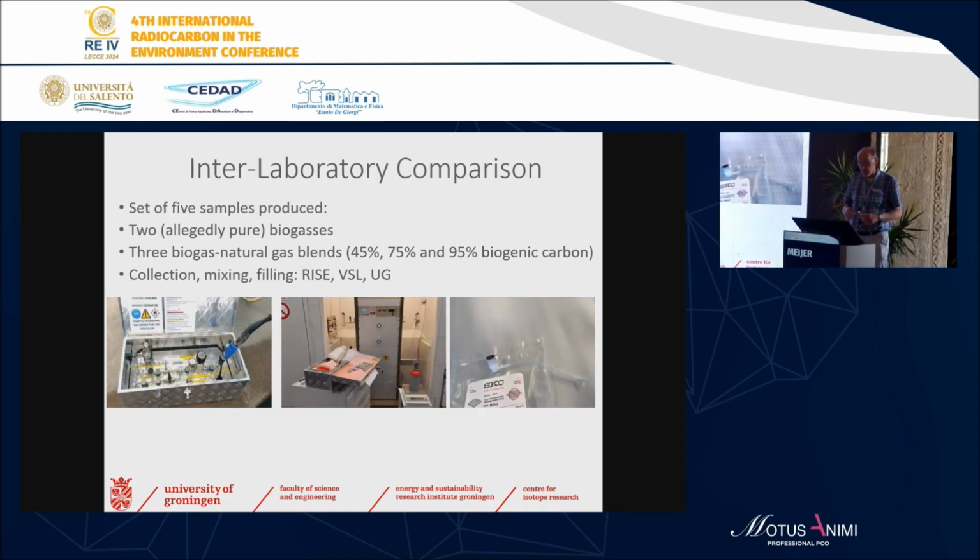Collection was done by RISE, a Swedish organization. VSL, the Dutch Metrology Institute, did the mixture very carefully and quantitatively. And we at the University of Groningen finally packed all this and distributed it and collected all the information from the results. And then the sample preparation, starting from this biogas until a final radiocarbon result, was done by 4 experienced radiocarbon labs in Europe.